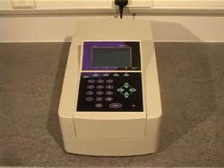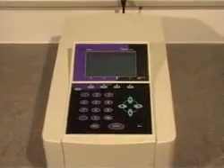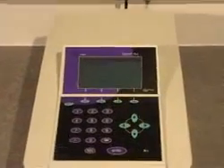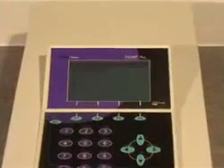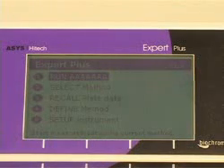After initialization, the user has a choice of running an existing method, viewing stored plate results, or defining a method.